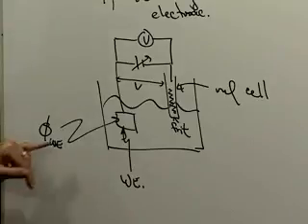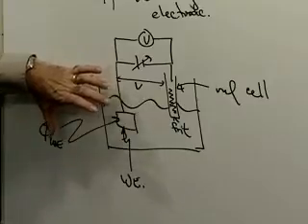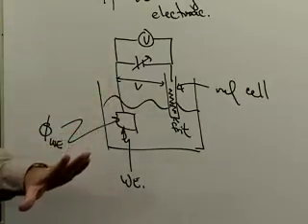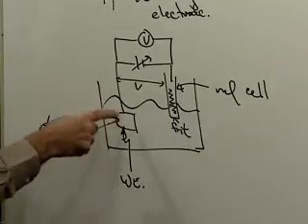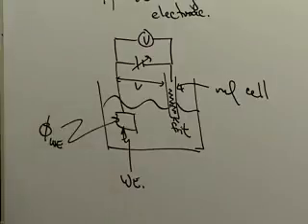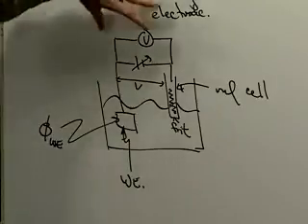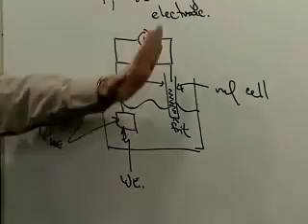Okay? And if you do that now, you now have a potentiostat, right? That is, you have a built-in feedback loop, the freshman feedback loop, and that guarantees that that potential stays. So as the chemical environment around this working electrode changes, we adjust the overall voltage in the cell so that we maintain a constant volts versus our reference electrode.